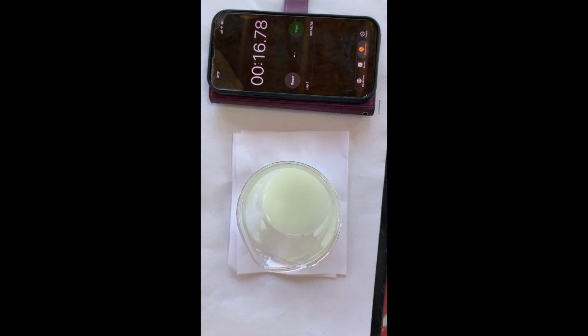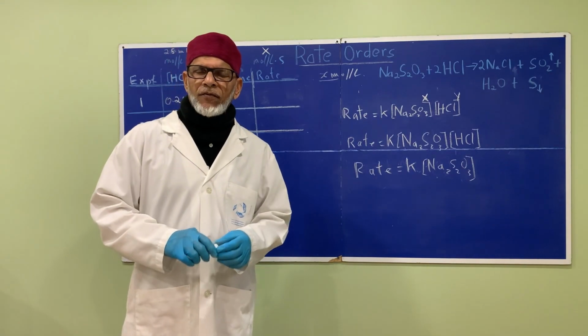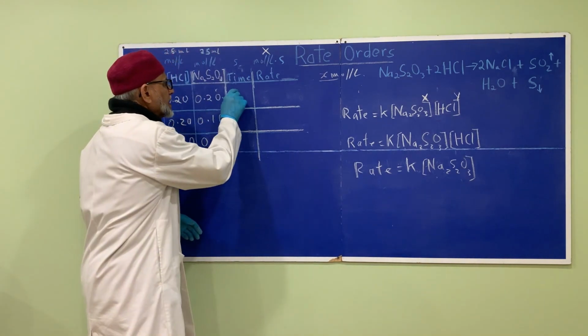16 to 17 seconds. All right. I think you should have gone to about 18 seconds. Okay. All right. We're not going to make a big fuss if we are out by a few seconds. We're just trying to establish certain patterns, right? So we'll call this 18 seconds.